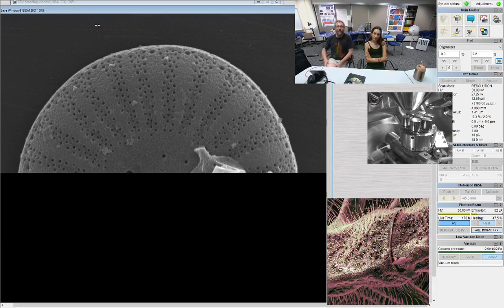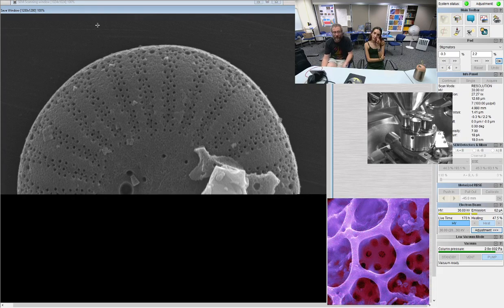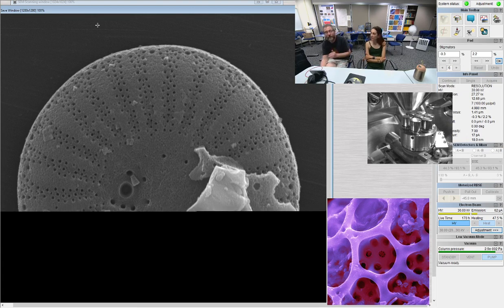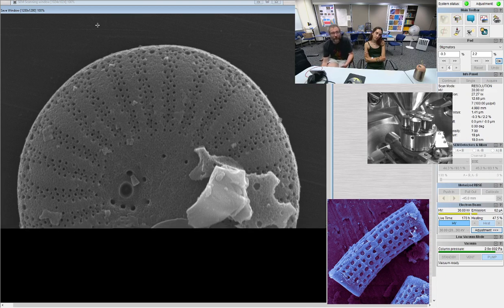So I found a nice middle ground at 1280 by 1280 for 3 minute photos at speed 7. Of course, you could lower the speed settings, but then you lose resolution, so you're just wasting your resolution. If I raise the speed to 8, which decreases the spot size, we could get a higher resolution image than this.